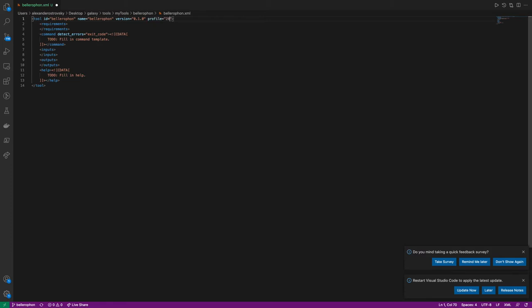Python template version is not required as we will instead be changing it to profile. This is the minimum version of Galaxy that is recommended to use this tool. Beginning in 19.05, that does also specify the minimum Python version, and therefore we can delete it and instead replace it with profile 20.01.